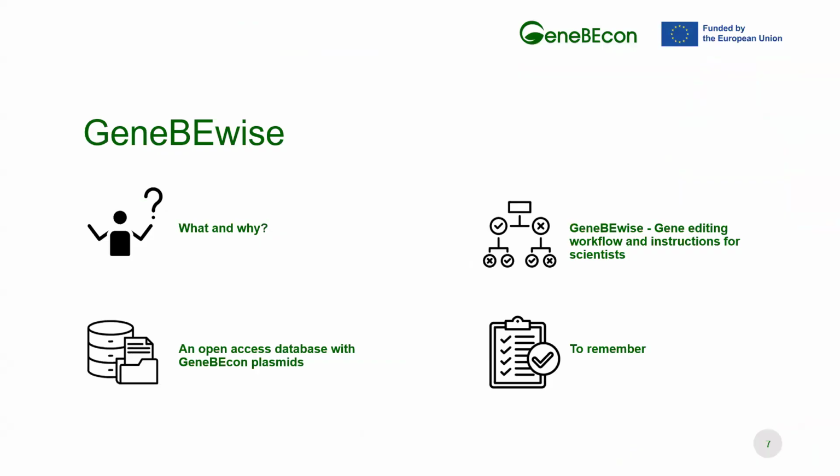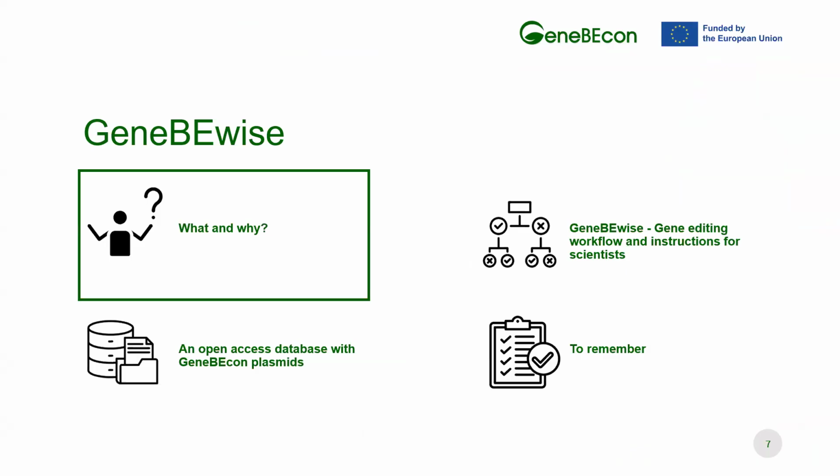So I will tell you a bit more about why and what the toolbox is. I will then go deeper into the plasmid database that we developed, and then also into the GeneBeWise toolbox itself, so the gene editing workflow and instructions for scientists, and then a few things to remember. So let's start with the what and why.